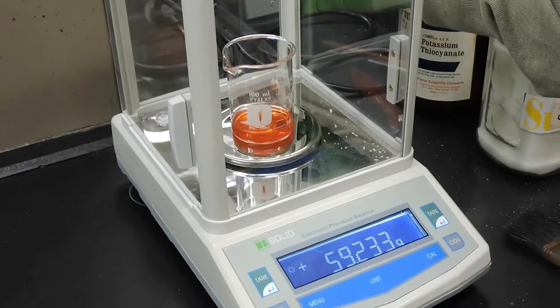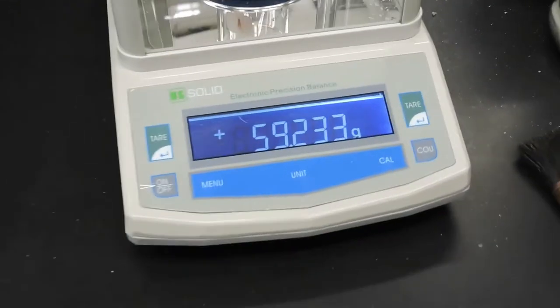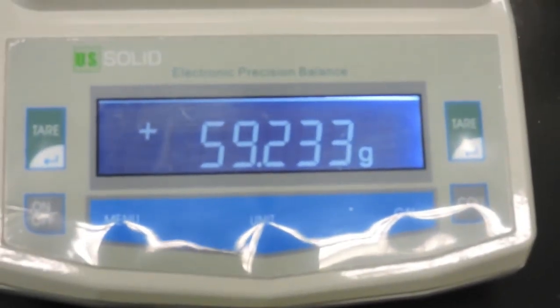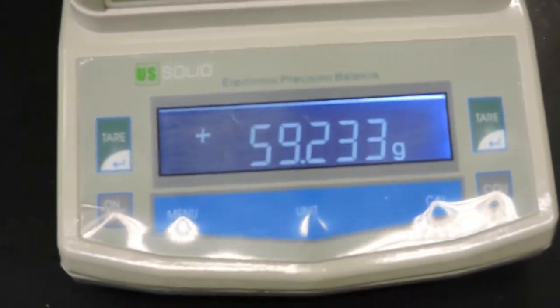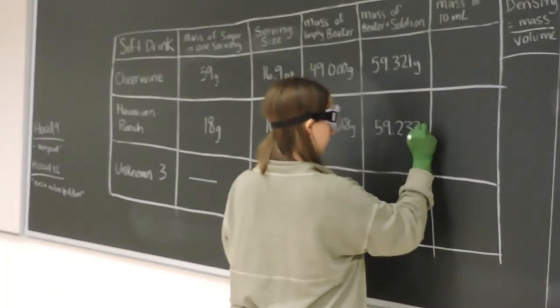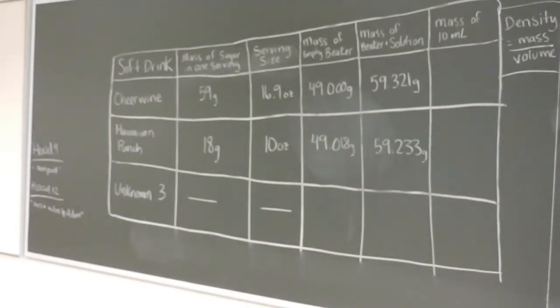And with the 10 milliliters in the beaker, we'll find its mass. And that is 59.233 grams for Hawaiian Punch.